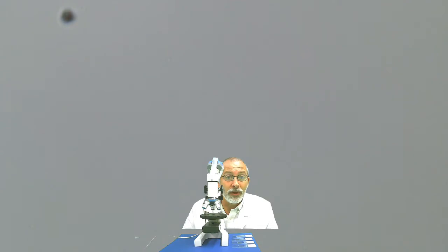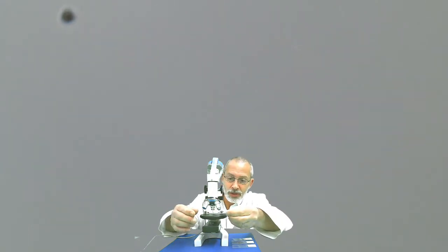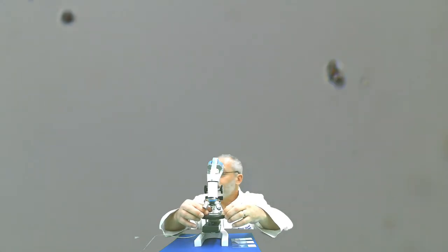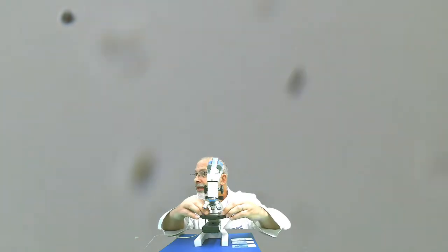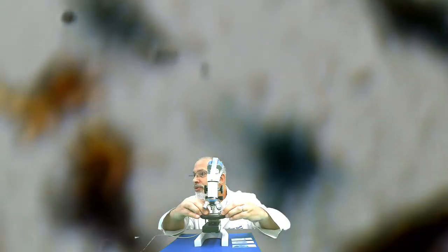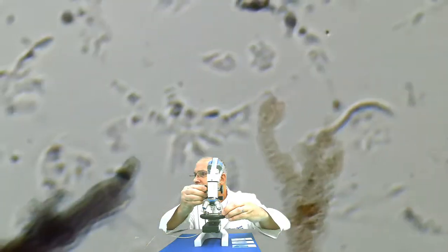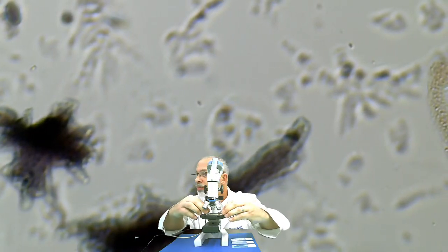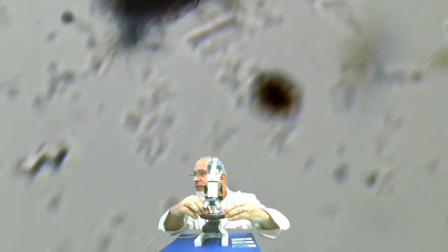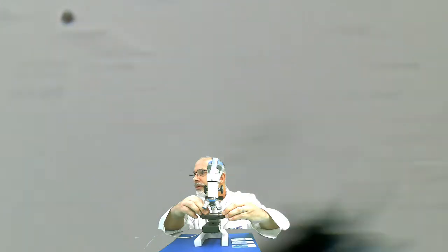So let's begin with our first specimen. Our first specimen is the amoeba. You can review your notes as to what the amoeba are, but as I get these specimens in focus, we've got to find them first. So here are some amoeba. Don't start drawing yet. Let me get some good ones in view. Ooh, there's some good ones. Let's get a nice collection of them here together.